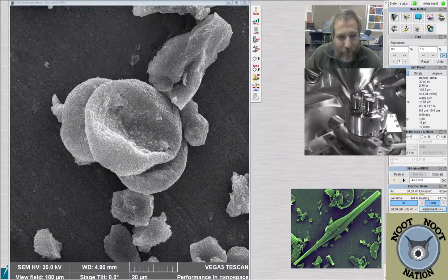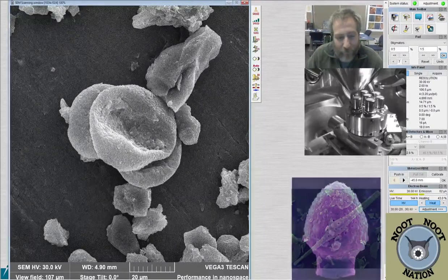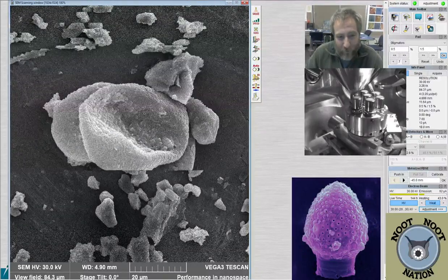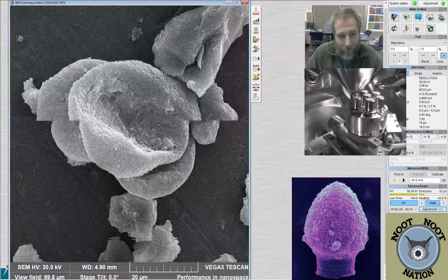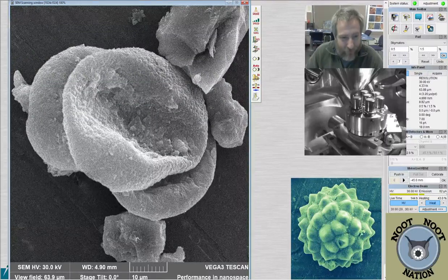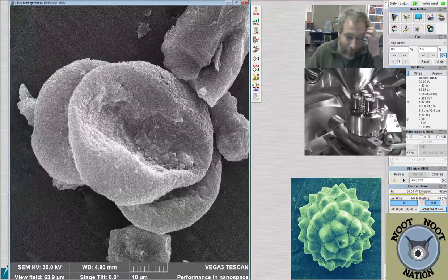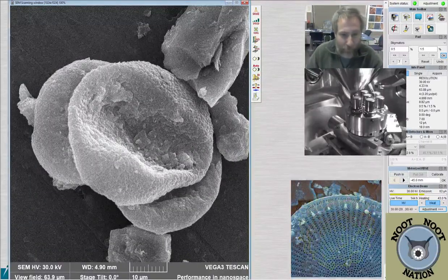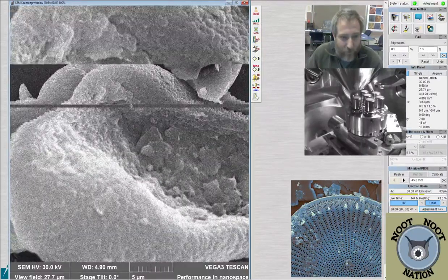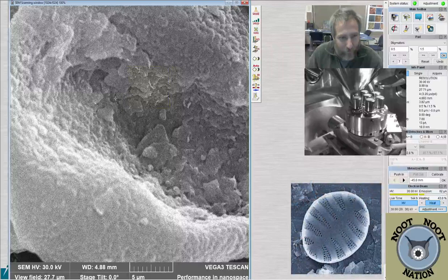It would be nice if we could take some of the larger grains and just get them out of the way, but it's not really an option. I could poke them a little bit with a micromanipulator after the fact, but it's hard micromanipulating things that are this small, even to be able to see them in a type of microscope where I could poke at it, and then to actually move particles without destroying the diatoms is kind of a challenge. So I usually just leave them on there and deal with the fact that things aren't always perfect.